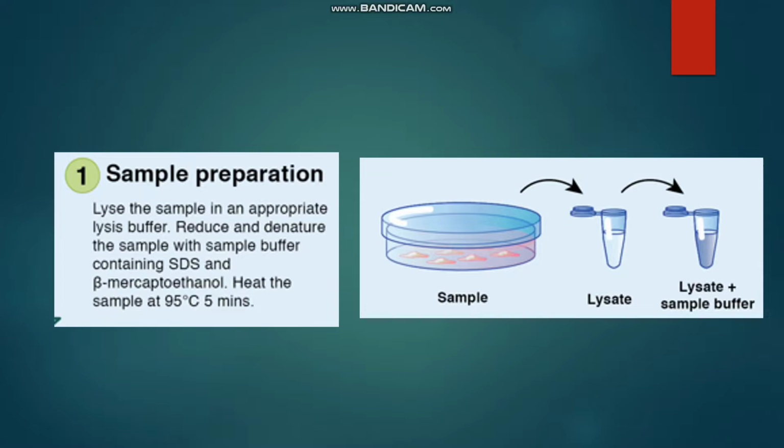First step, sample preparation. Here we have to lyse the sample in appropriate lysis buffer, reduce and denature the sample with sample buffer containing sodium dodecyl sulfate, which is a detergent, and beta mercaptoethanol.